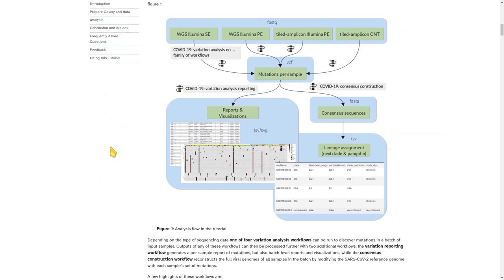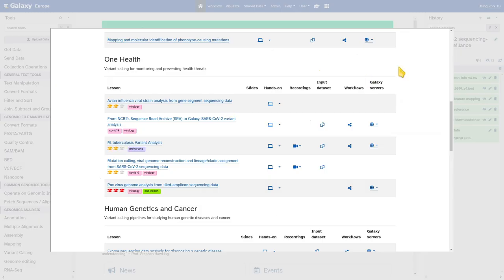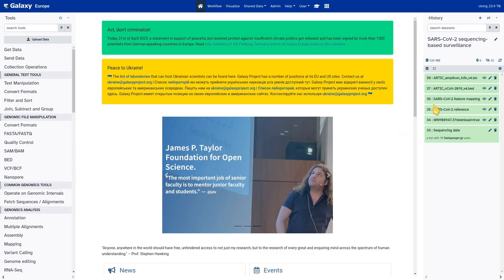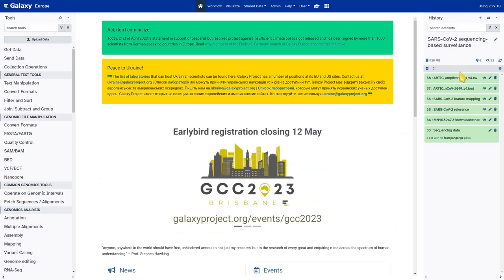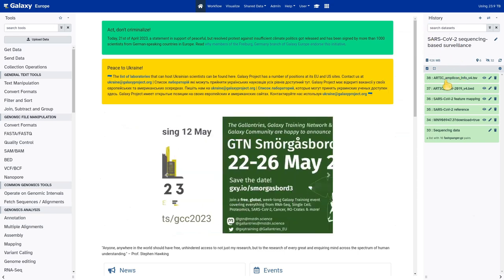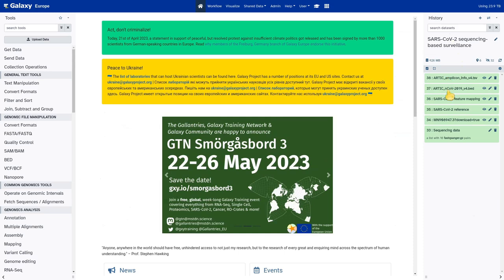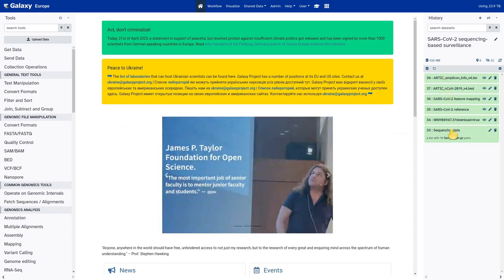Let's start, because this is going to be brief and just explain the more complicated steps in the tutorial. I already set up my analysis history — I created a new analysis history, named it, and followed the instructions in the tutorial to upload all the necessary input datasets.